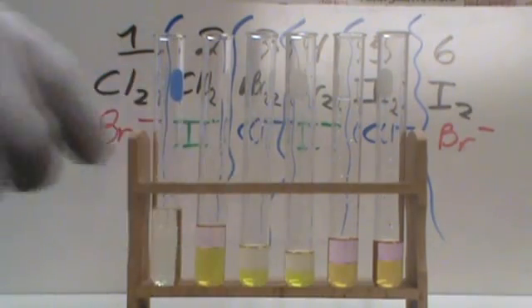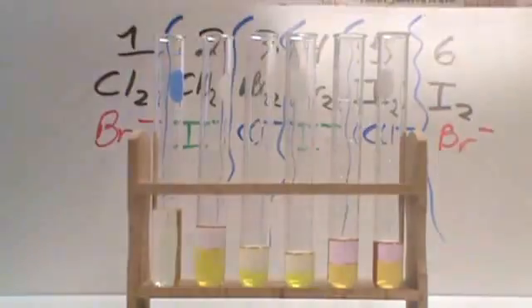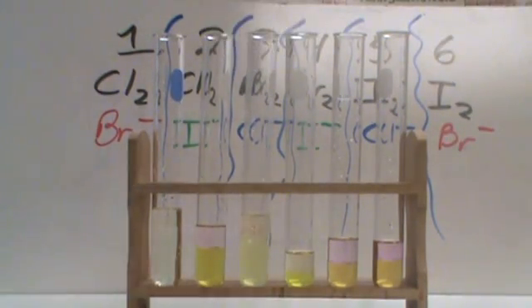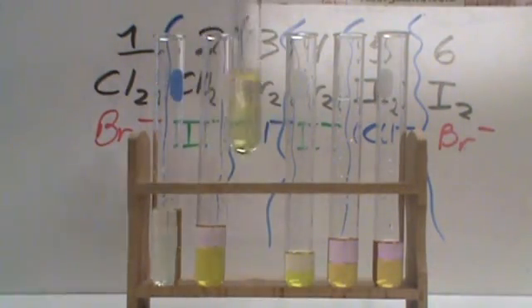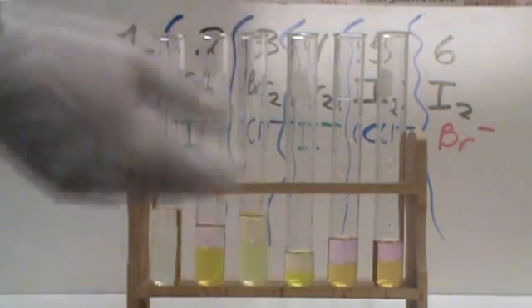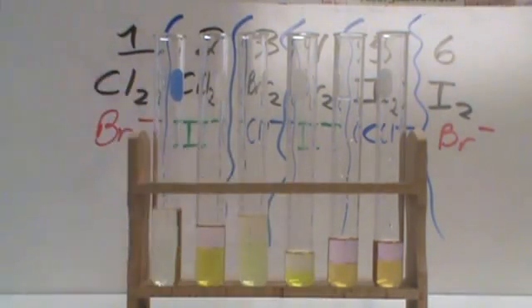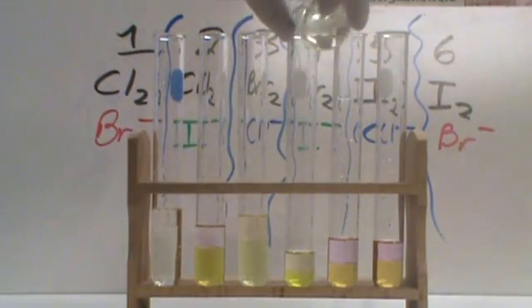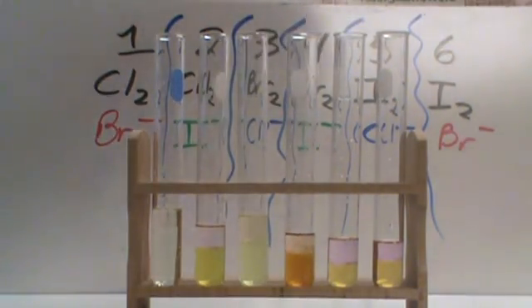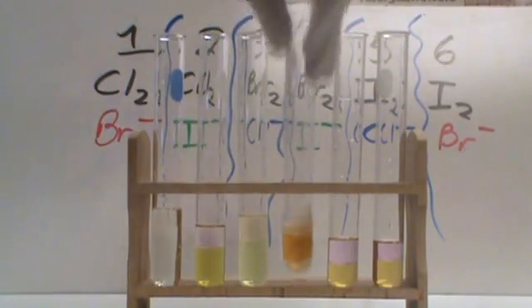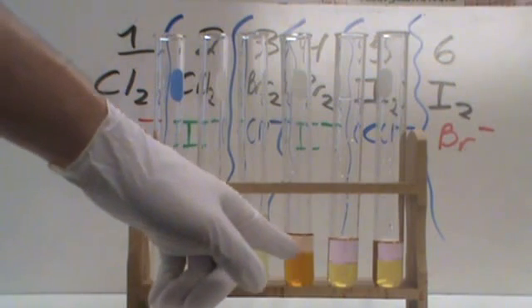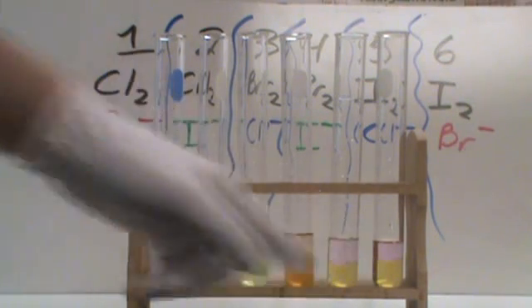Now in the bromine liquids, I'm going to add chloride to one. When I add the chloride, nothing's going to happen at all. It's going to stay the same color as what it was before, except for being slightly more dilute. It's still just the bromine. But when I add the sodium iodide to it, the reaction is going to take place. I can see that this is forming iodine and bromide ions. I can see the purple color and the brown color that matches these over here.